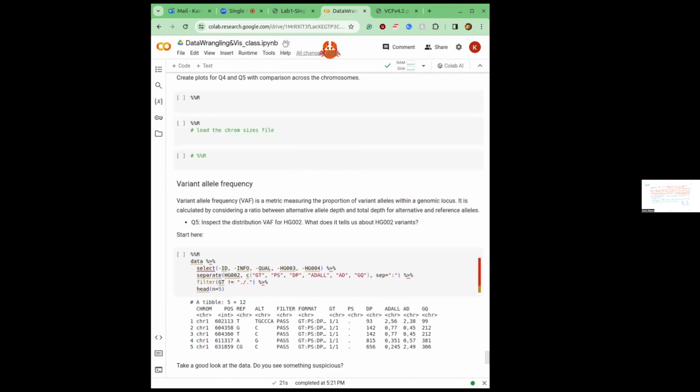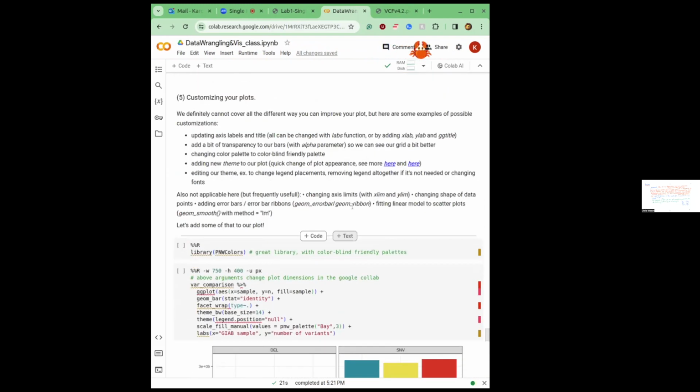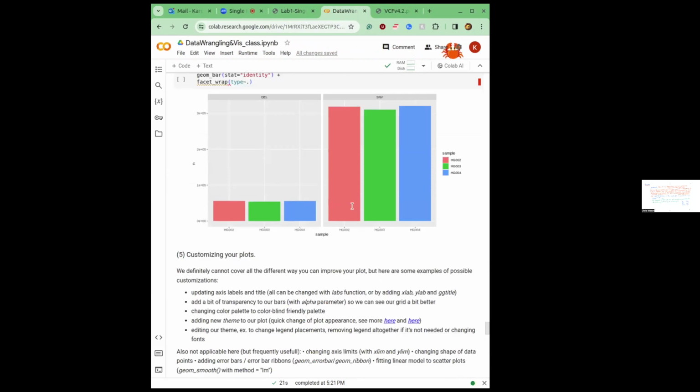I think I'm gonna switch to slides. So this is basically the same plot, just added again and again.